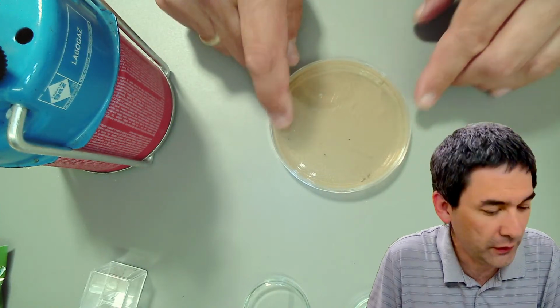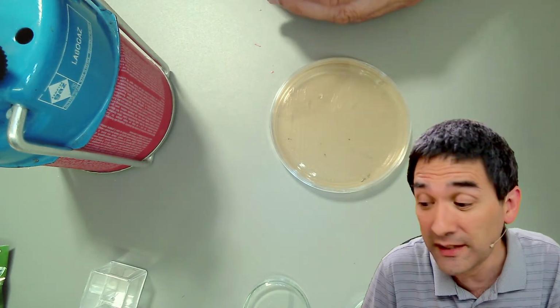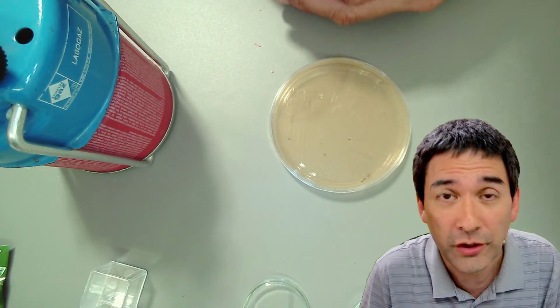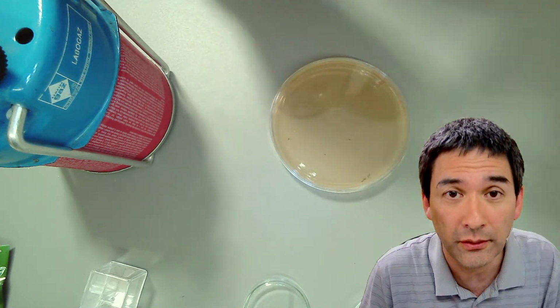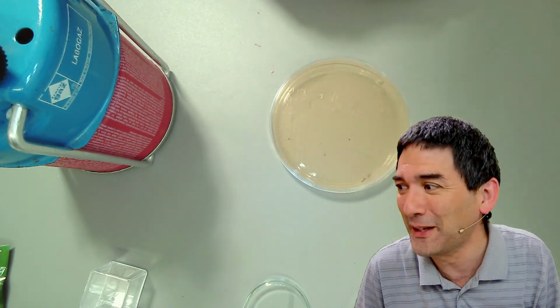You never ever label it on the lid, because then you might exchange the lid. And as a matter of fact, this has happened. When I was at university, a different microbiology department in a different country sent us some samples, and they were labeled on the lid. And then you already know that the person who did that was not properly trained.